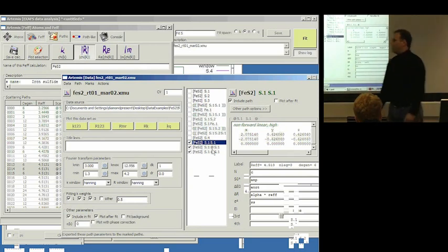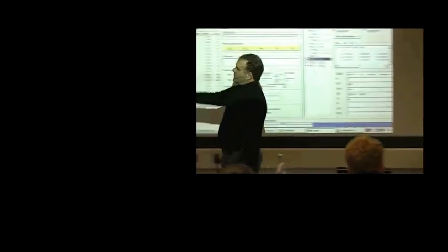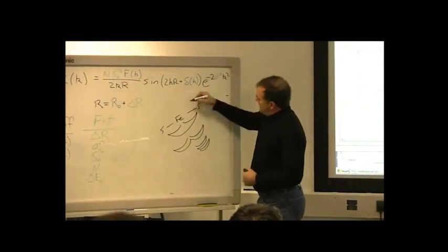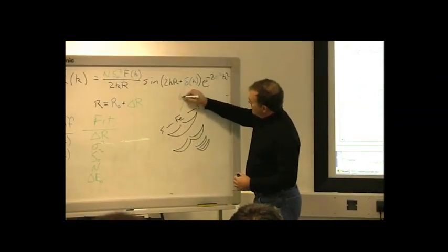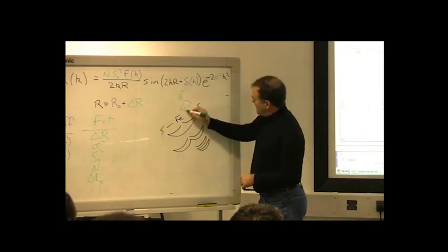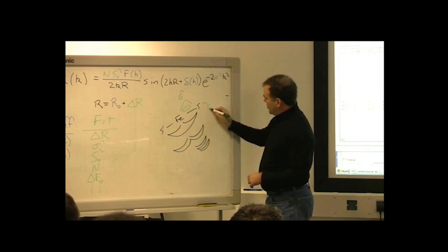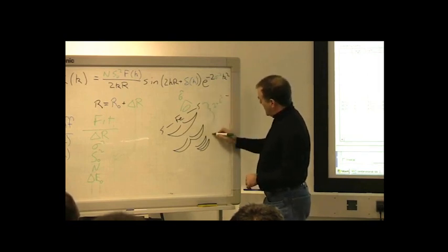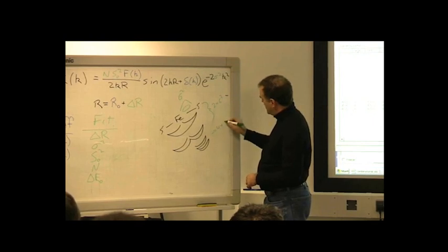These two, if this path gives a value of sigma squared, these two are 2 times sigma squared, and this one is 4 times sigma squared.